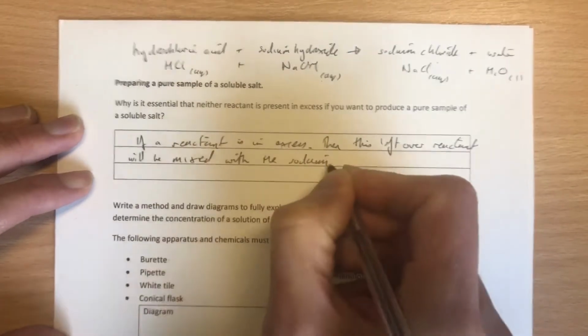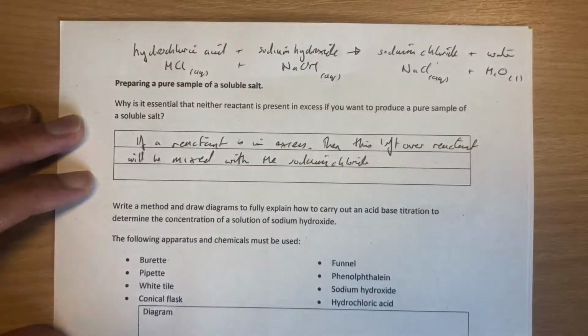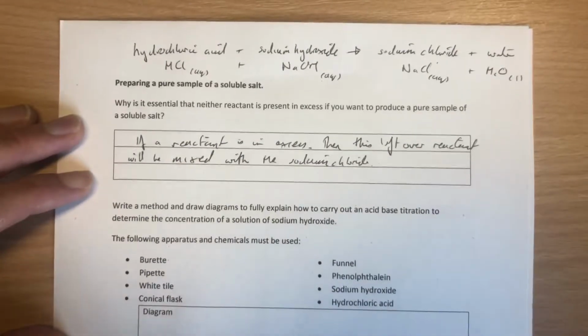Now in year 10 we looked at titrations, so we reacted exactly the right amount of hydrochloric acid with exactly the right amount of sodium hydroxide.